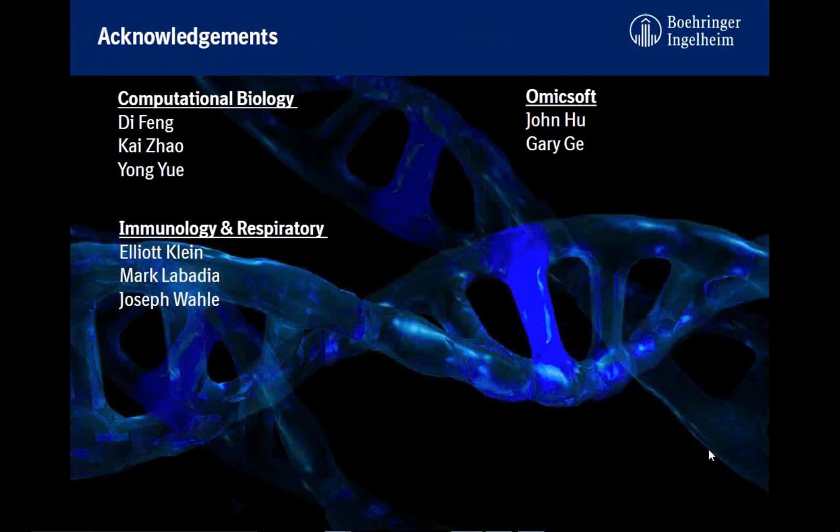without it, you still get lots of meaningful results. For example, if you correlate the particular gene expression with cell cycles, you can remove lots of genes, and the remaining genes could be interesting. Sometimes it's just a confounding factor. Rather than what you really want to understand, with the T cell, you ask, are you really interested in cell cycle, in genes correlating with a particular cell cycle?